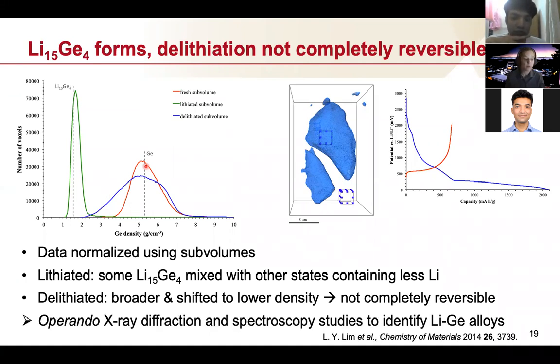And then we have a follow-up paper led by Linda Lim, which I would suggest you look at, which uses diffraction and spectroscopy to really confirm what those species are. So with the combined technique, we're able to get the real full story.